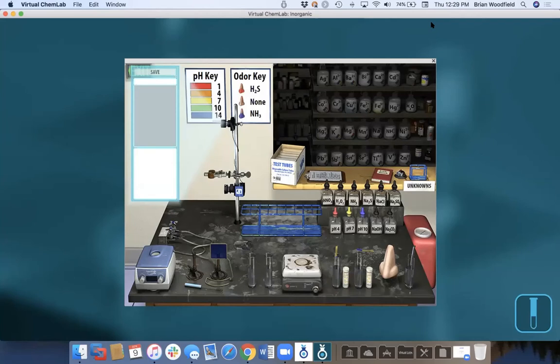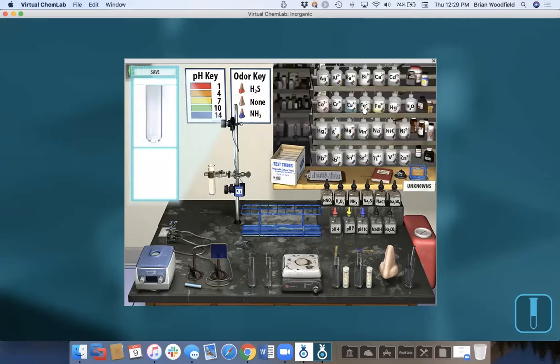Brian, you mentioned that you didn't have, for example, cyanide, ferrocyanide. Any reason for that in general? Oh yeah, what happens is, with all the cations, the possible presence of silver will oxidize the ferrous up to ferric, and you'll never know if you have ferrous or ferric ion in there.